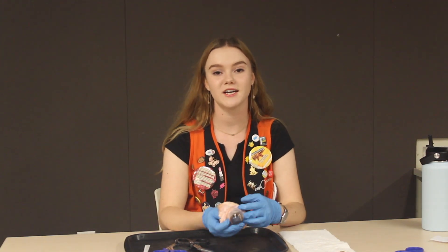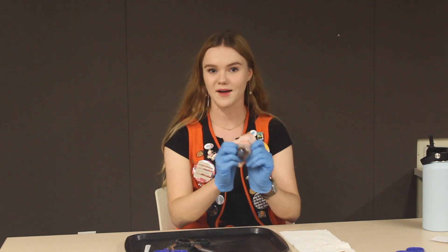Hi everyone, my name is Lillian. I am a current high school explainer at the Exploratorium and today I'm going to be teaching you guys the cow eyeball dissection.